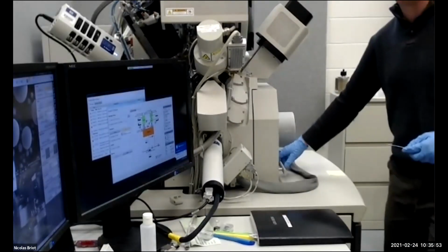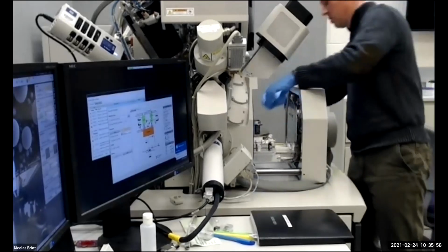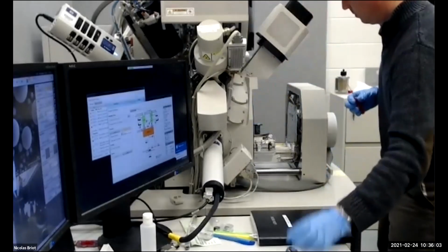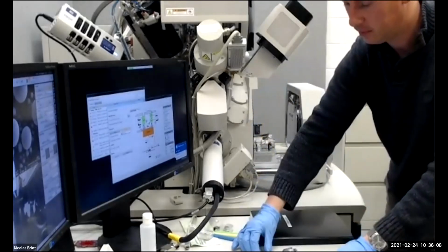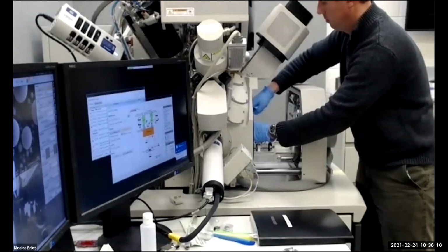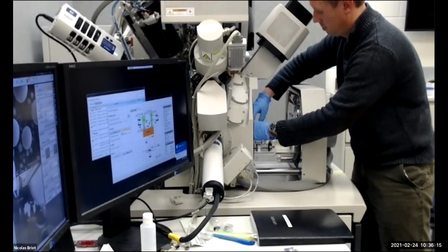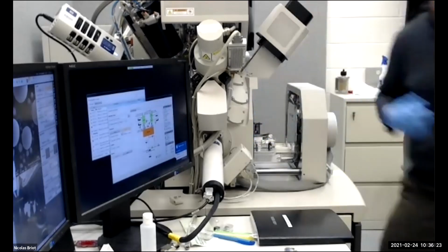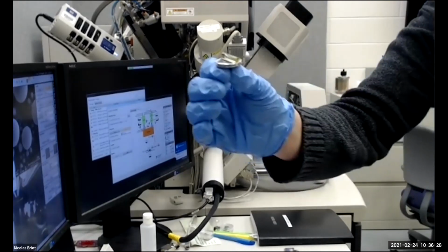Opening the chamber. You see the samples are right here. I'm going to put the sample like that.